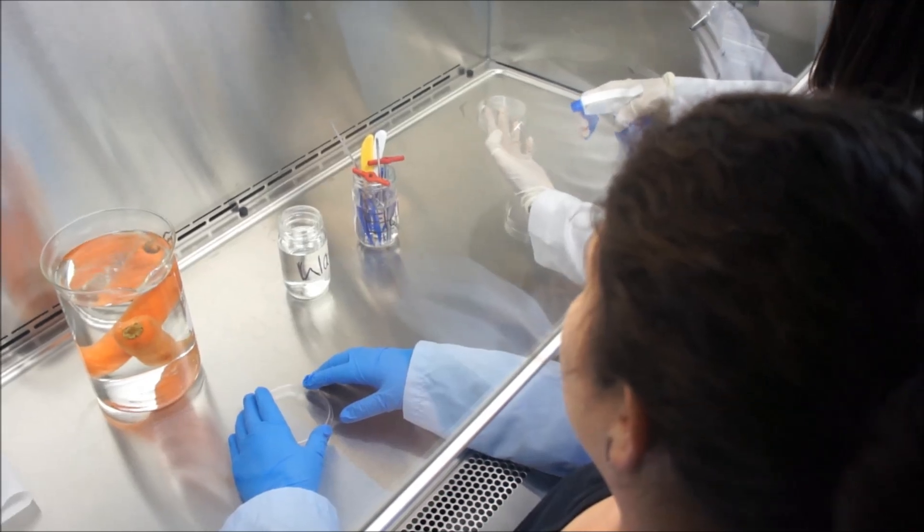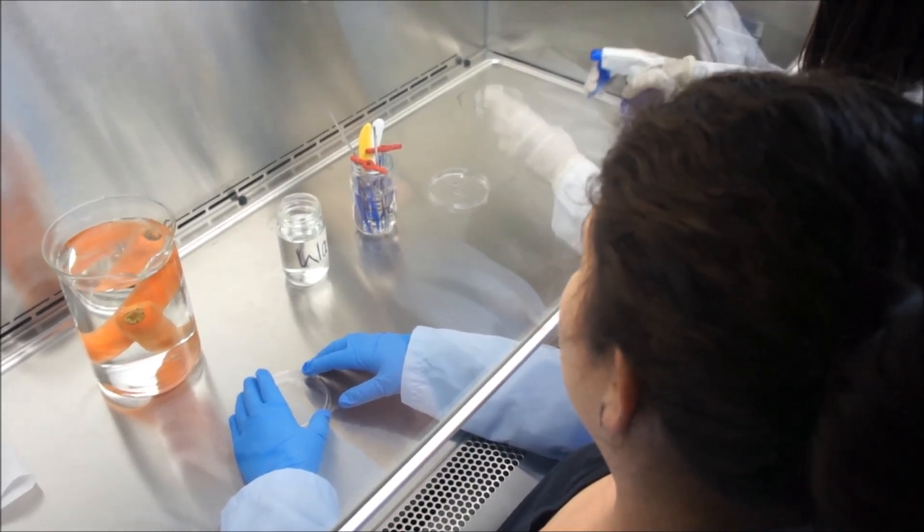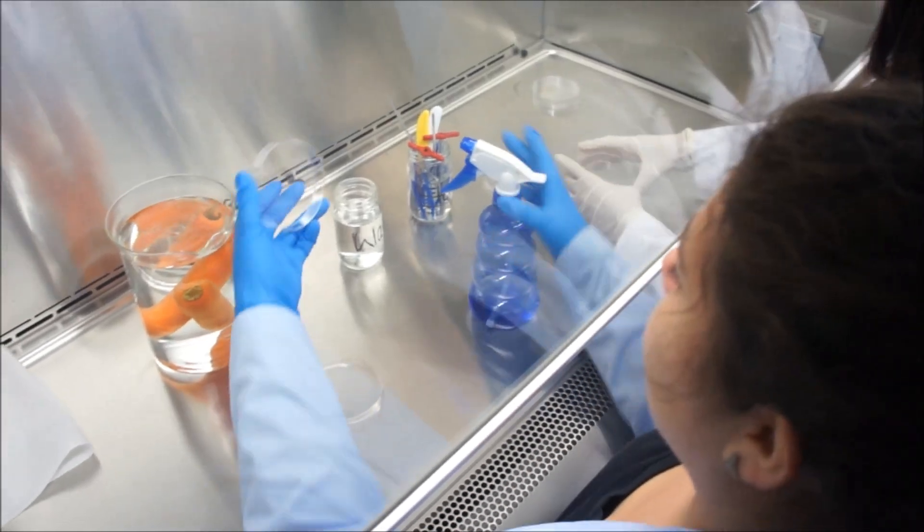Put the root large end down in a sterile pre-tiered dish into which a few drops of ethanol have been poured or sprayed.